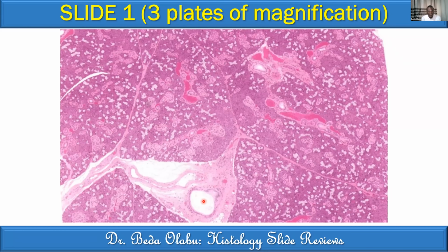However, we can also see ducts inside the lobules, those tiny ones. But we are not able to confirm at this magnification if that is actually true. However, this one perhaps is more confirmatory, or that one. So other than extralobular ducts, we also see ducts within the lobules. We call them intralobular ducts.